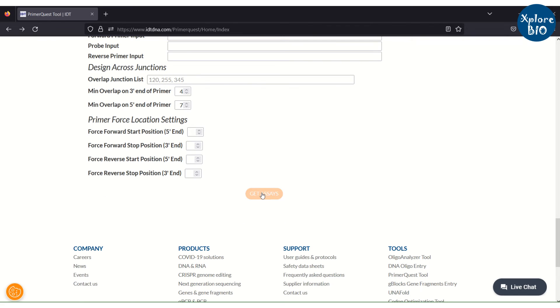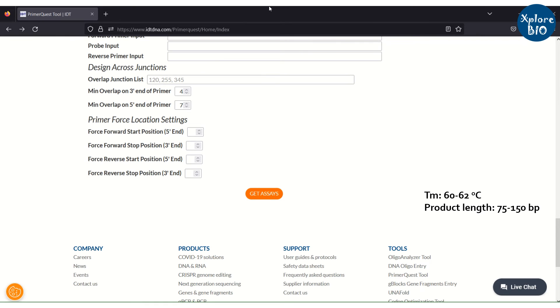By default, a Tm of 62°C and an amplicon size range of 75–150 base pairs are well suited for qPCR primer designing.